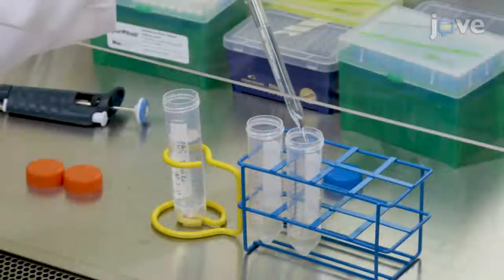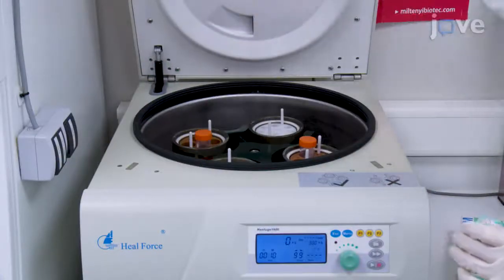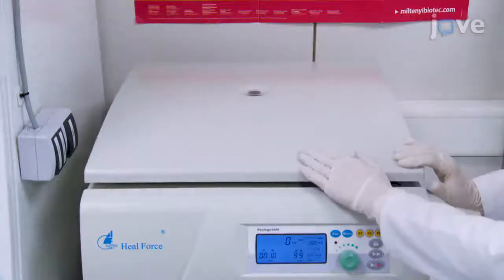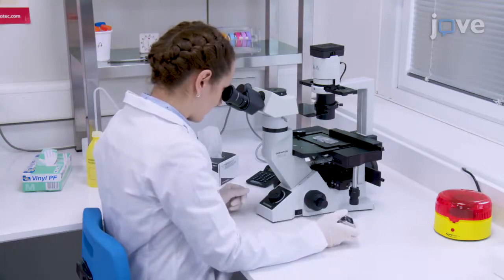Wash the isolated cells with 5 milliliters of sterile PBS and centrifuge at 300 times G for 10 minutes. After repeating the procedure twice, count the number of cells using a counting chamber.